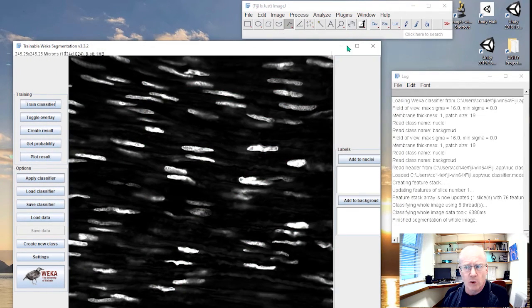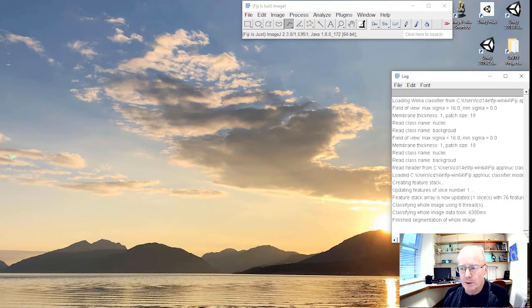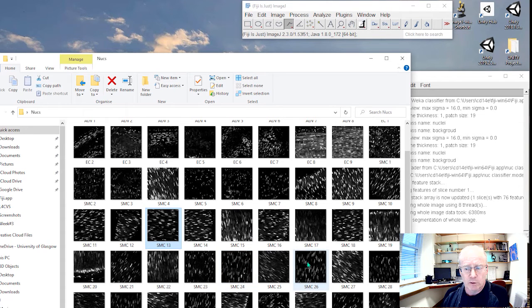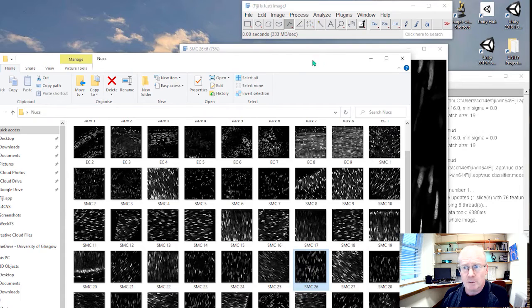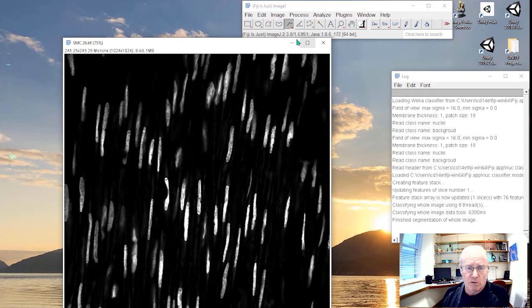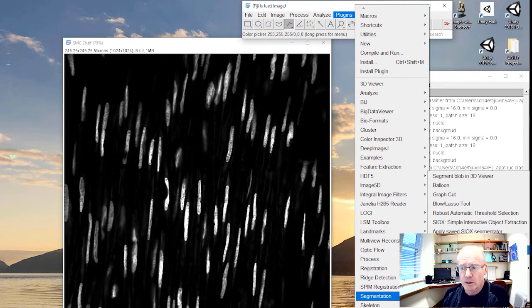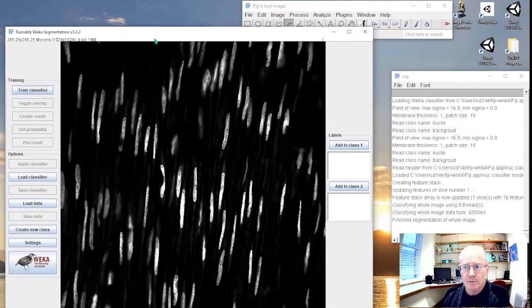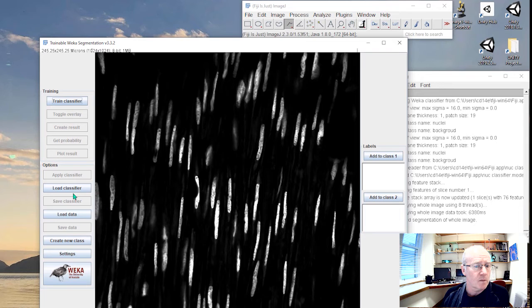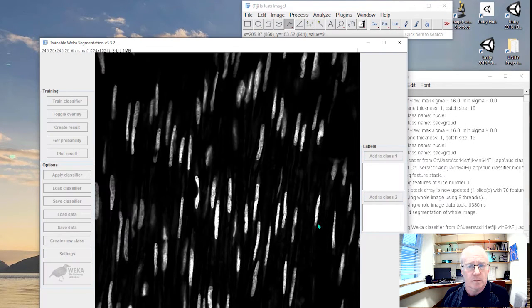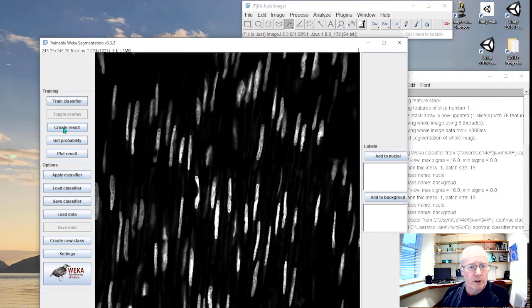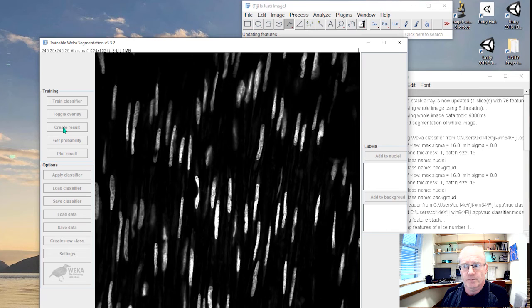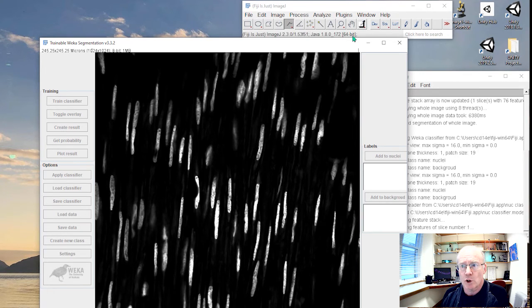Let's try though an image in which the nuclei are going in the opposite directions. Let's say which one we go for. Maybe this one here. It's a nice image. So the objects are roughly the same shape, but they are going in the opposite direction. Will our trained algorithm be good enough to detect them. Load the classifier. There we go. And wait until, and then we'll create the result.